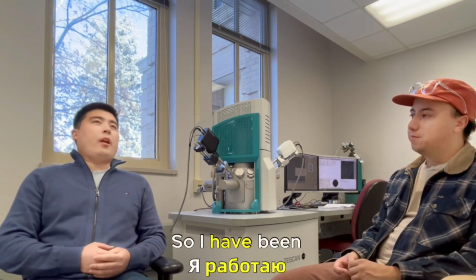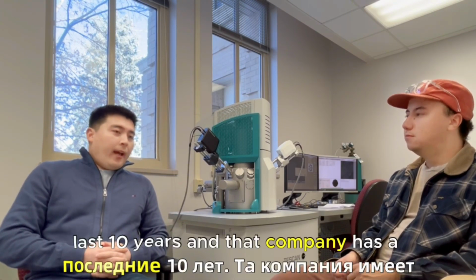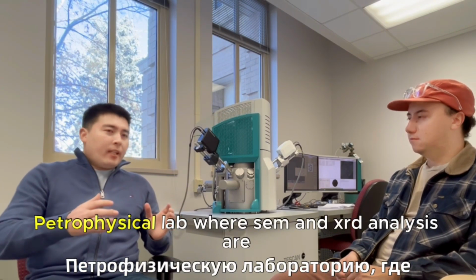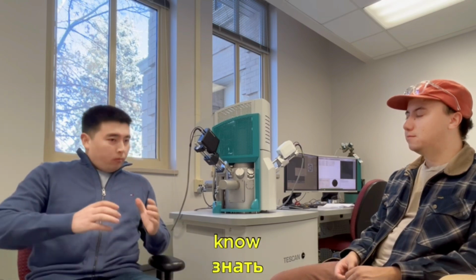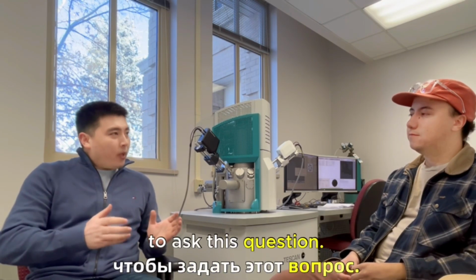Okay, interesting. So I have been working as a head of petroleum geochemistry in Kazakhstan for the last 10 years, and that company has a petrophysical lab where SEM and XRD analysis are performed depending on the request of the customer. So I'm always interested to know the differences. So it is the right time to ask this question.